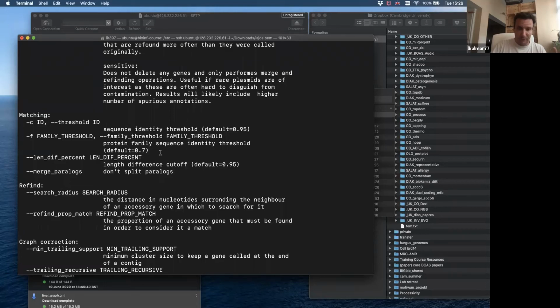So the main problem here, and this is what we already spoke about last time when we looked at those Staphylococcus epidermidis isolates, is that you have to distinguish between two sets of genes. So let's say that you have 10 isolates to compare. You don't need a reference genome here. You just need the isolates. You need the FASTQ files. You have to assemble them with any of the methods we already discussed. You have to annotate them. The easiest way to annotate is Prokka.